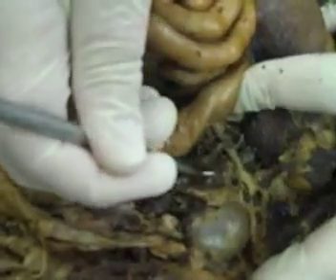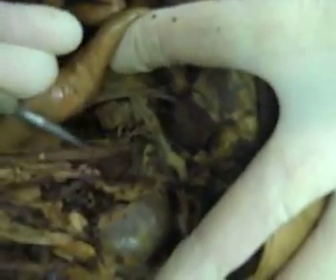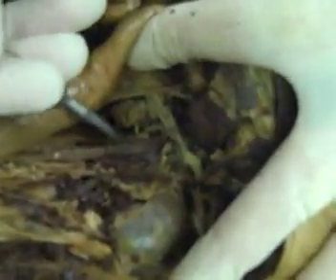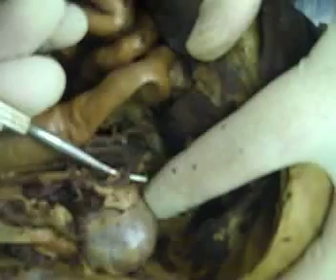There's a blood supply to the kidney, also on the medial side of the kidney. Here is the renal vein. And do you see how that renal vein connects back to a vein on the midline? See this vein right here? Somebody say yes? Yes. Okay. You know what that is? It's going up to the heart. Posterior vena cava. That's the posterior vena cava. And that's connecting, or I should say the renal vein is connecting to the posterior vena cava.